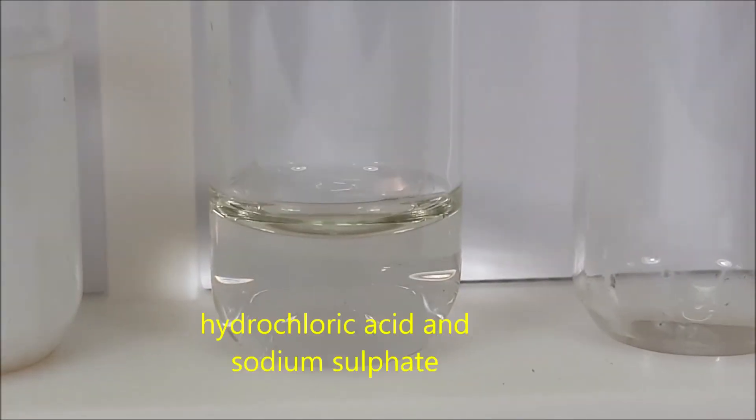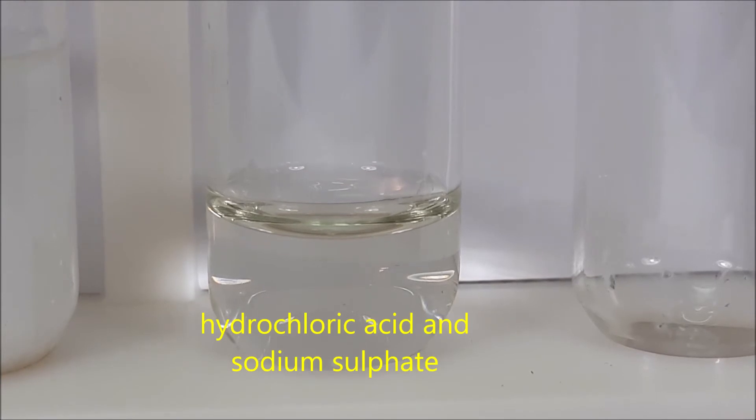For test tube number ten, we have potassium hydroxide and sodium sulfate.